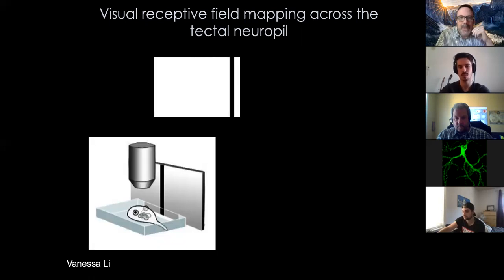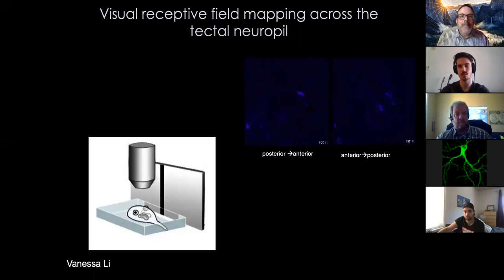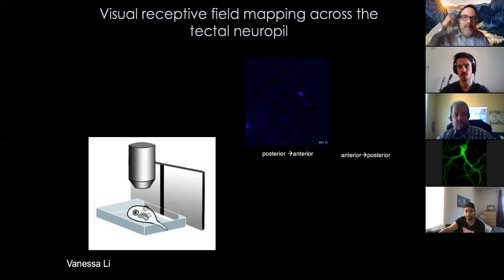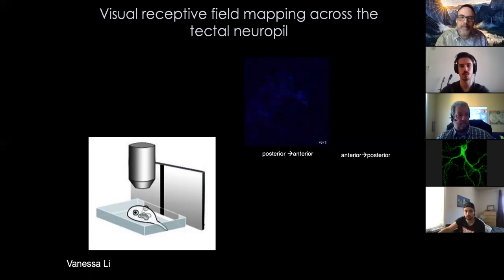within the tectum. I have some images, this is what it looks like as it sweeps. This is sped up quite a bit, but we've got in one case the stimulus sweeping from front to back, and in the other case the stimulus sweeping from back to front. And I think you can make out the movement of response across the optic tectum.